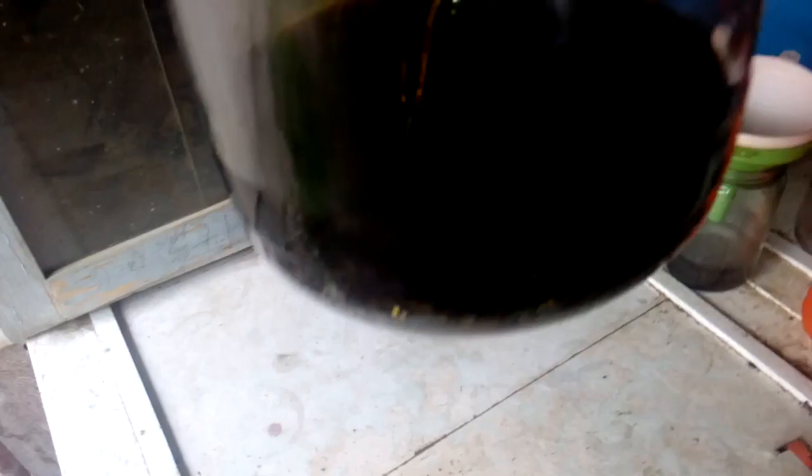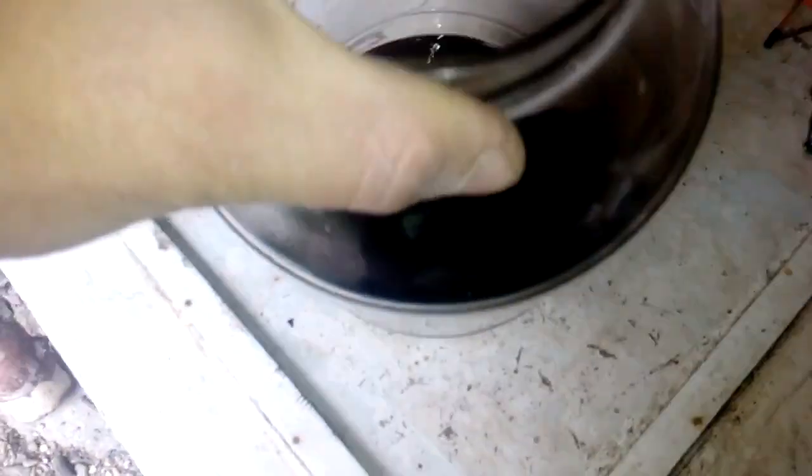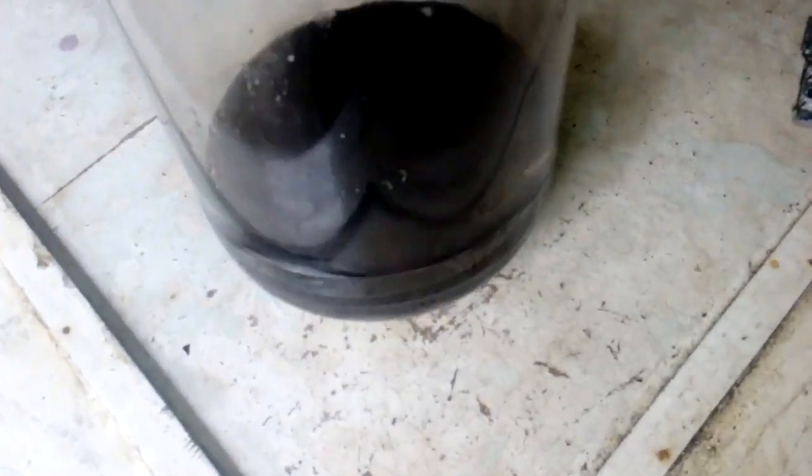After two days our solution is now very dark. That means the reaction is very good and the copper from the pins is going into the solution. Let me show you something about what is happening.